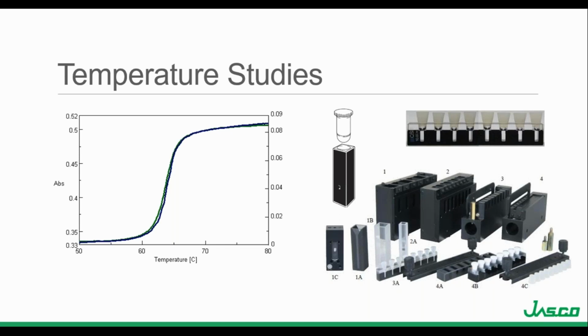So if you are using a micro or sub-micro cuvette but do not intend to fill the entire cell volume, you're going to need to use low headspace cells. These cells have larger stoppers to keep the evaporation loss of samples such as DNA to a minimum. Otherwise, if the cell is not completely filled with a solution and stoppered, the evaporation of the sample can occur inside the cell during the heating process.